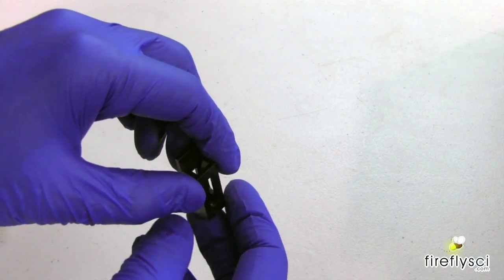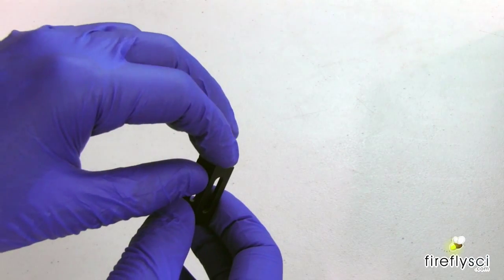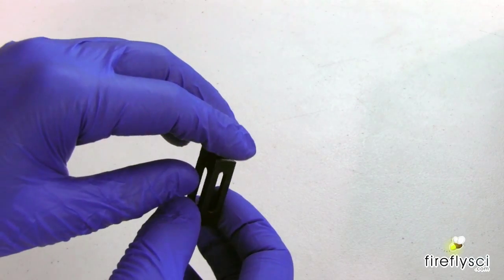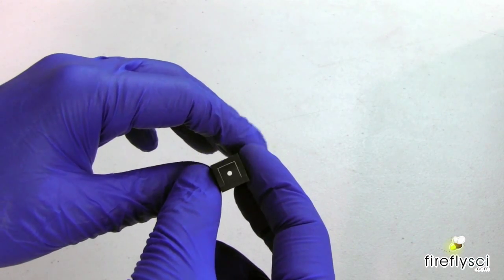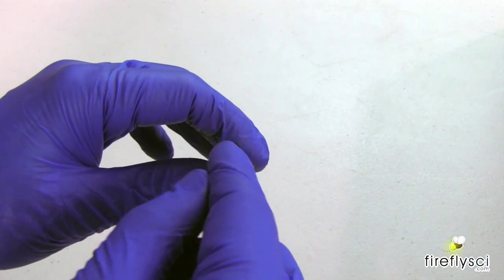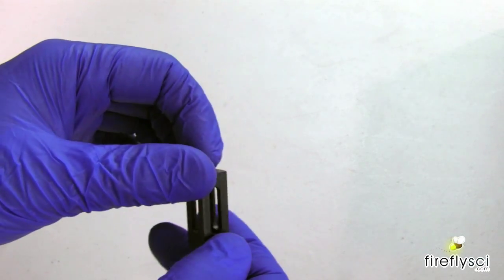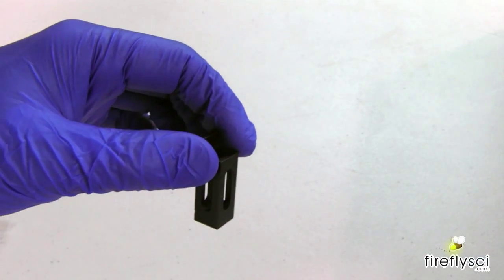There's one note I wanted to point out about the A23 holder, and this goes for the A24 holder as well, which is built for our Type 507s, is that it has a hole in the bottom here. So in case the cuvette gets stuck in there, you can put something small like a paper clip and push the cell out the top. So let's go ahead and show you how this goes in the spectrophotometer.